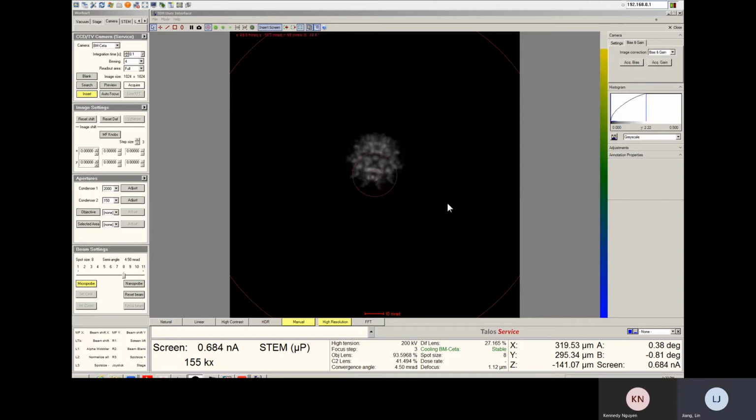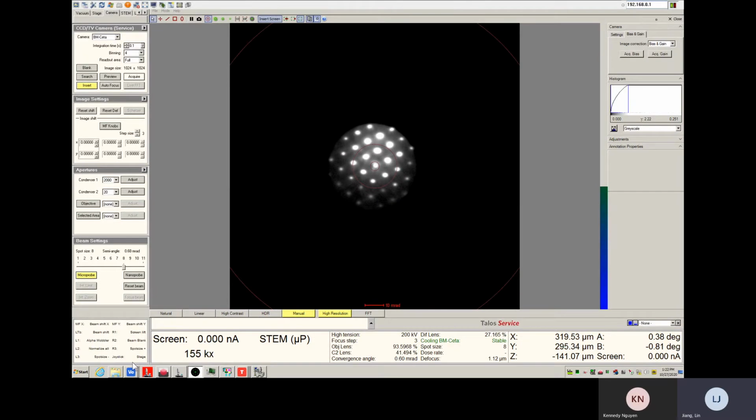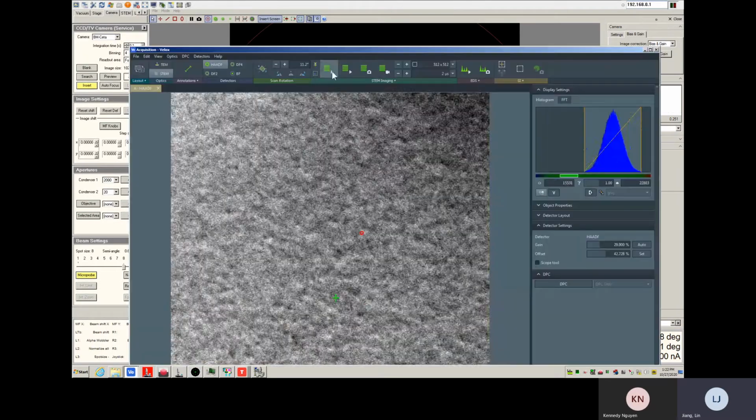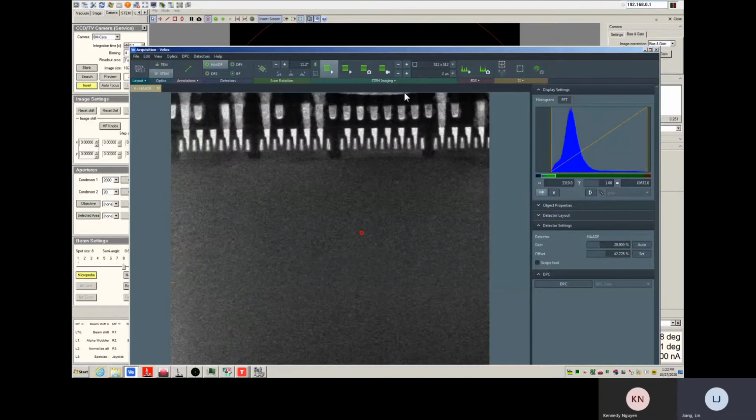So we will go one by one. We will go from 1 to 51. We will go for 20 first, and then take an image, and then we go for 50, take another image, 70, take another image. We will consider this effect, and then we can compare the difference. So let's first move to the center of the sample to get a good region. We just go there to find a good region.